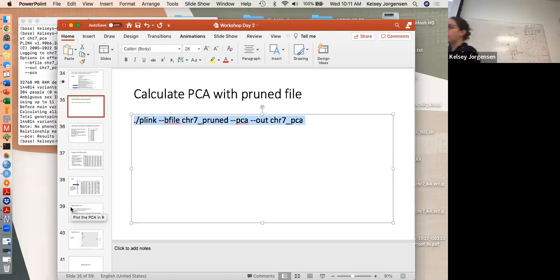Did you get them okay yet? I did. I misspelled pear. Oh, is that what it was? Yeah, but now there's a new issue. Is it in? Yes. Oh, so you don't have the bed file in there?